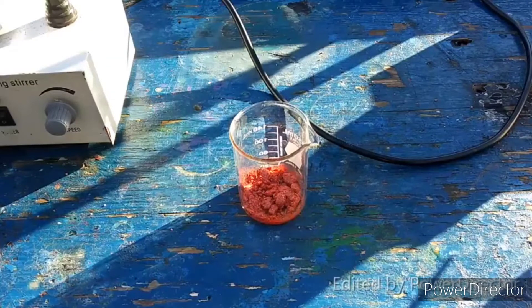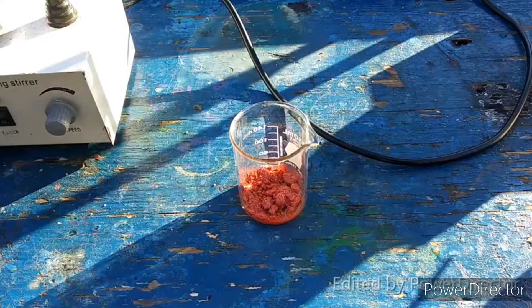Hello everybody and welcome back to the Poor Man's Chemist. In this short little video I am going to be making arsenic trisulfide from arsenic triiodide.